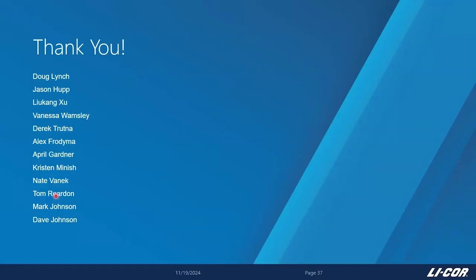But yeah, that's a great question. Let's see. As I was answering that, another question might have come in. They're getting answered by Lukong and Sasha and disappearing from my screen here. There was one earlier regarding data rates and data storage that I'll go ahead and address. So the native data output rate of this instrument is 1 Hertz, and onboard memory can store a couple of months worth of data of that 1 Hertz data. So I'll just knock that question out.